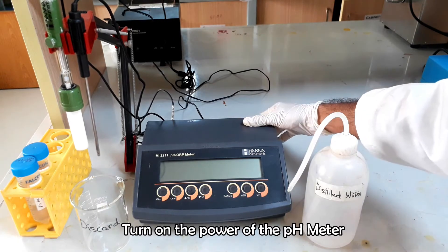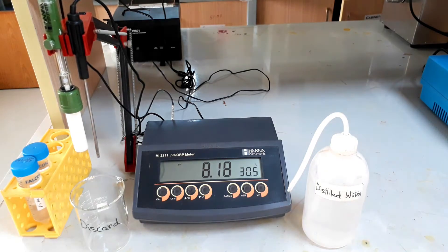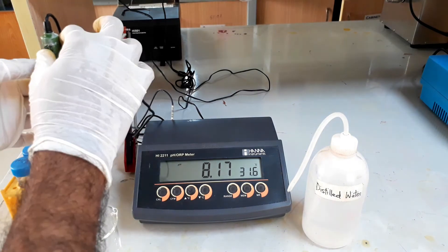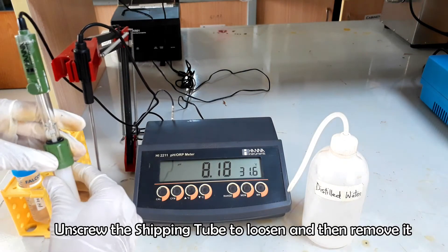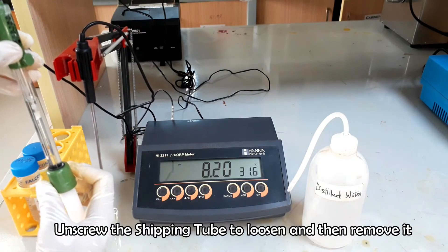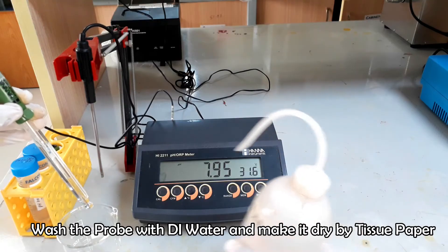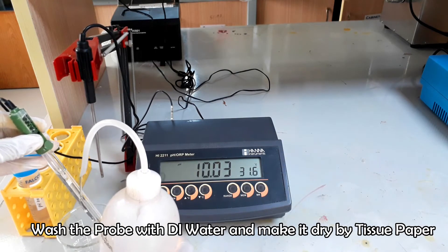Turn on the pH meter. Remove the shipping tube from the probe. Wash the probe with distilled water and dry it with a soft tissue paper.